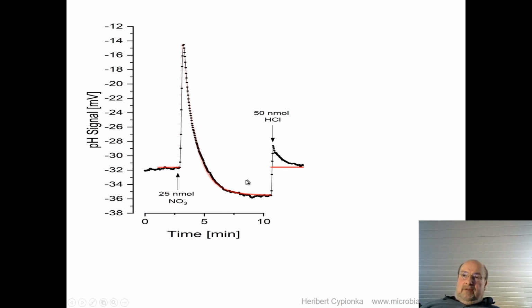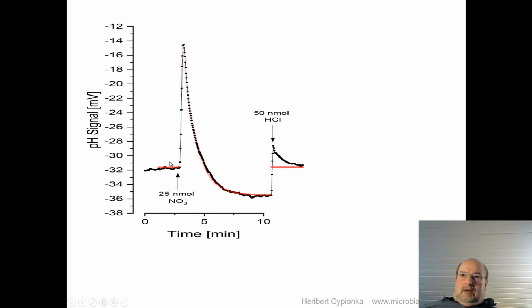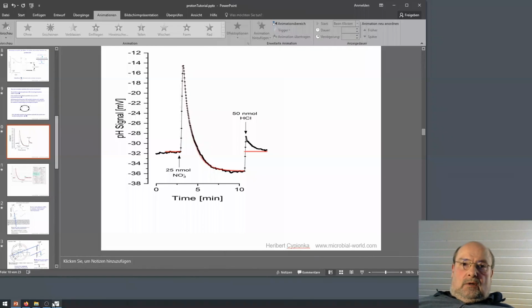We had a very fast pH electrode, and obviously the HCl was added with a syringe very close to the tip of the electrode. And then in the first seconds, you have an increased concentration there, and you have to wait some time until it gets to the real value to compensate the scalar effect. And now comes the simulation. I'm going to show you how this looks.